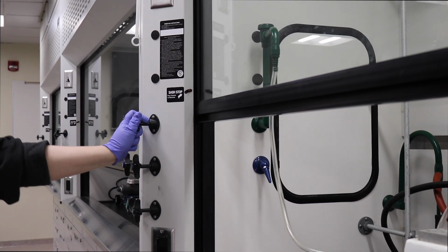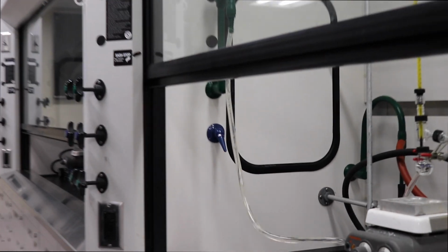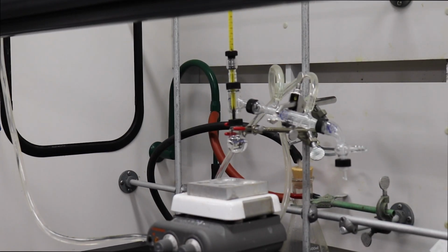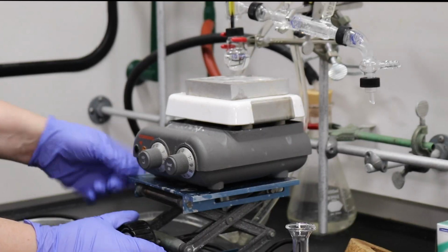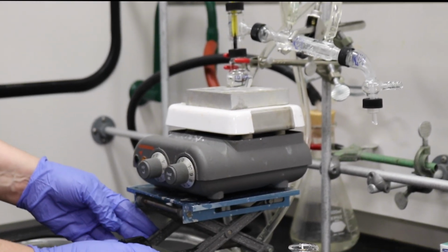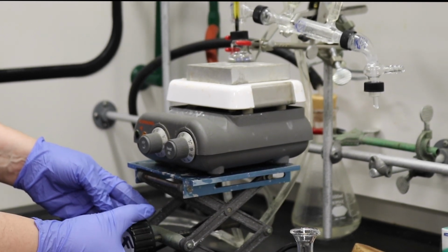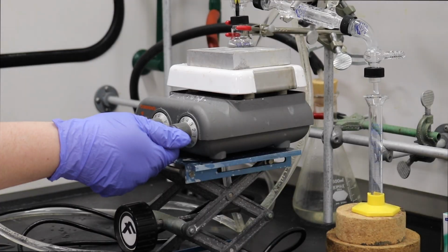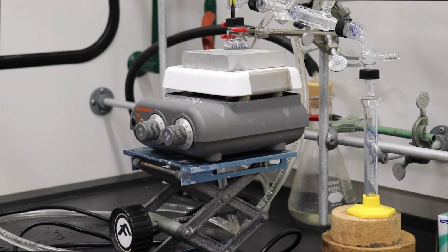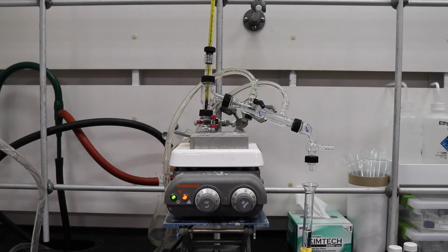Now we turn on the water. The water just has to be flowing nicely through the system, and you can see that in the video as the water is filling up. Now we have to raise the heating block and make sure that it goes into the round bottom flask, as you see here. Then we set our heat somewhere between 4 and 5, and we'll watch our system heat up.